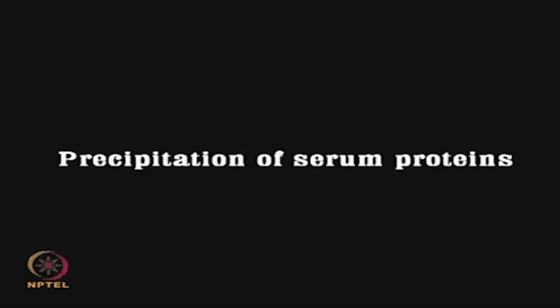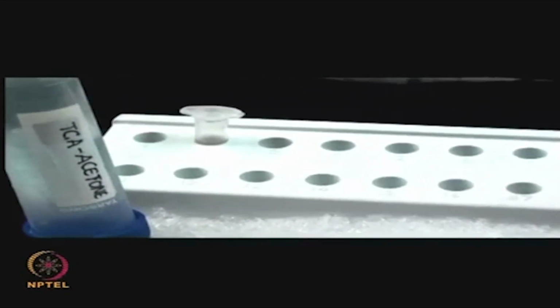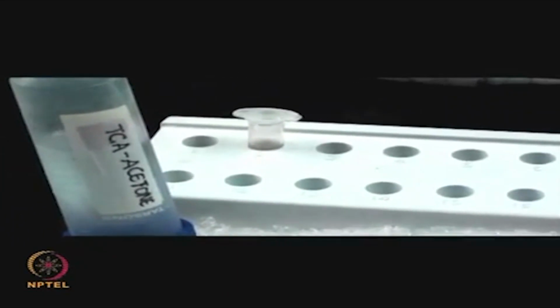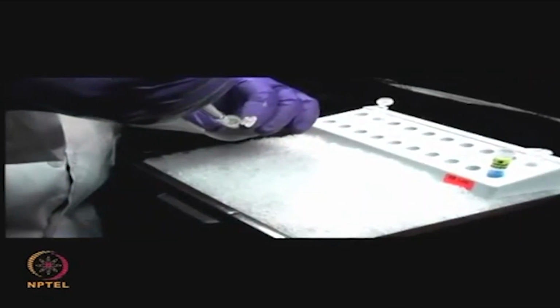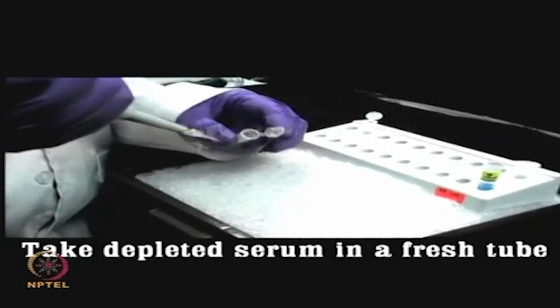Protein precipitation. Transfer the serum depleted of high abundance proteins into a fresh tube.